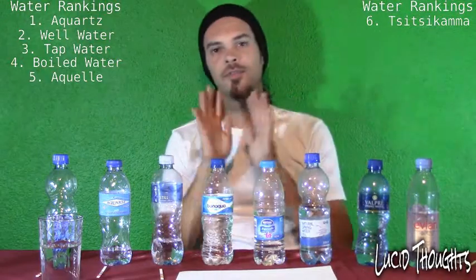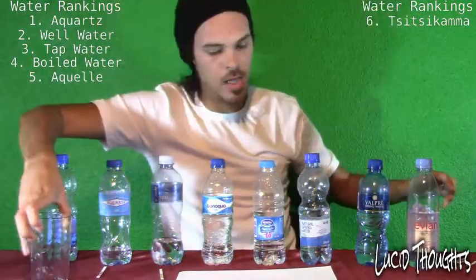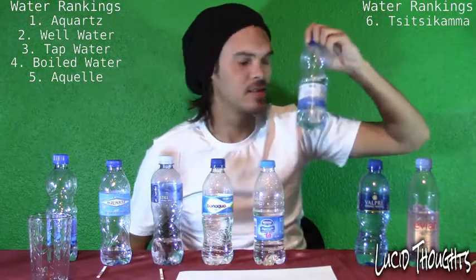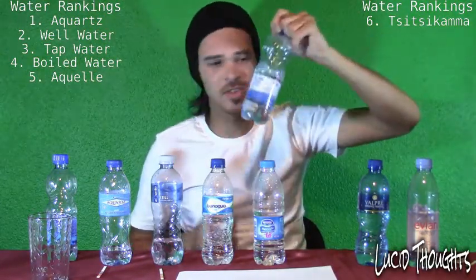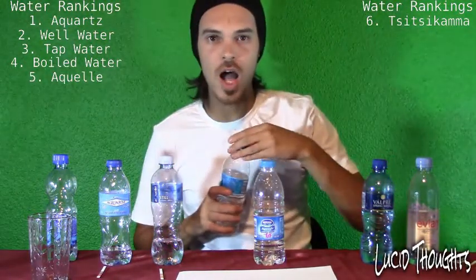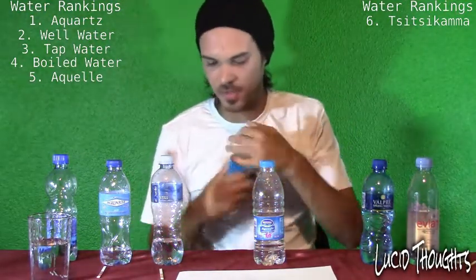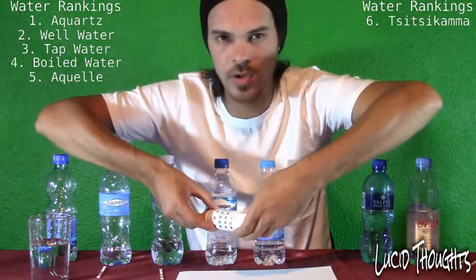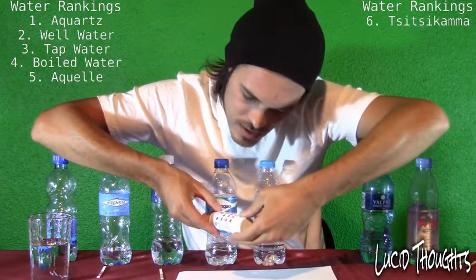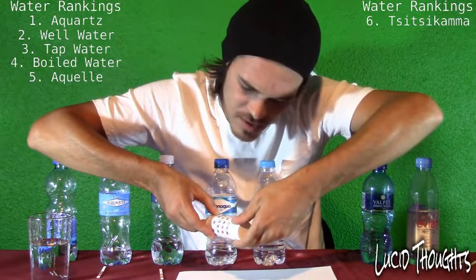I only have four strips left after my mess-up. I'm going to skip the Bikini Bay water — don't drink it, it's horrible, the numbers are bad and there's a reason it's so cheap. Testing Bonaqua: chlorine is zero to 0.1. All the bottled waters and tap water are fine for chlorine — we don't have to worry about that. The pH level is 7.4 to 7.5. The alkaline is about 20 to 30. Not too impressed with Bonaqua.